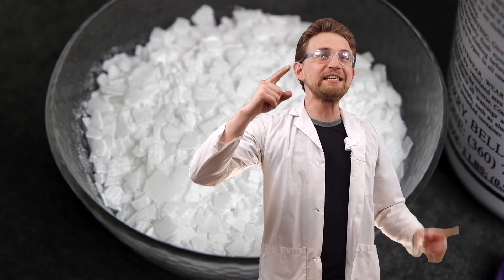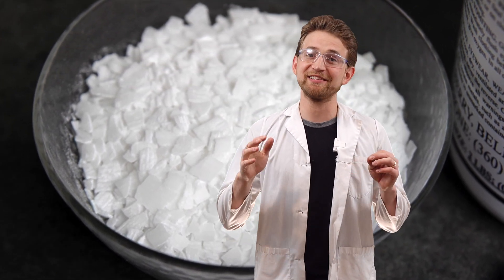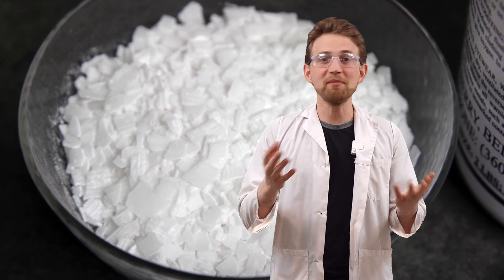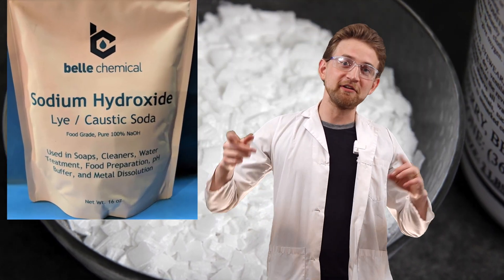Method number two. This is more complicated, and you do need to have some sodium hydroxide, which is lye. Lye is used for making soap, so you might have some in your basement. If you don't have lye, you can just say that you do, and then you're a liar.